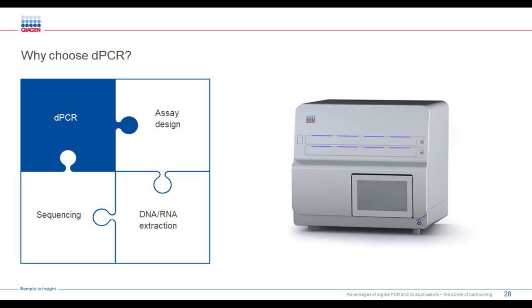No, but to be honest, as I mentioned before, if you have recently or previously run into issues, stopped a project because of too crude samples, due to extraction problems where you get very low yield, or let's say you cannot perform a PCR in a good way, or a real-time PCR because the efficiency has been just too bad and the data has been looking not good enough to present.